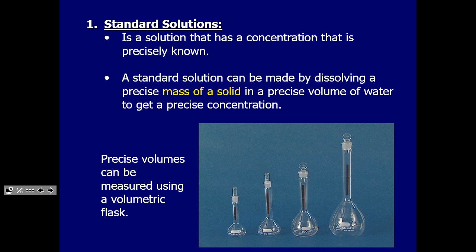Now, getting precise volumes is a different thing, right? Beakers are not used for measurement. Beakers are just used for transferring. So like if I were to say you need about 80 milliliters of liquid, I pour it into about 80 milliliters, I bring it back to the lab bench. If I want to measure a little more precisely, I might have you use a graduated cylinder.